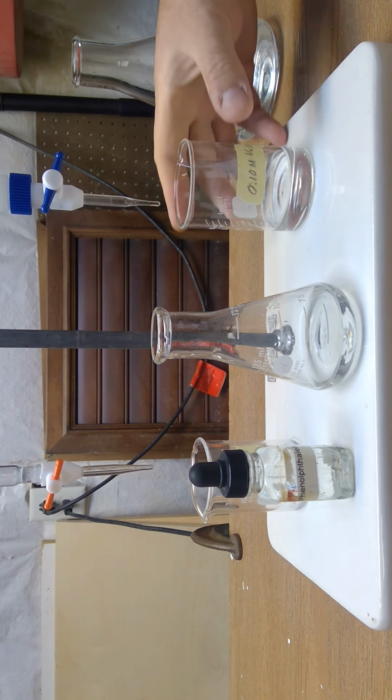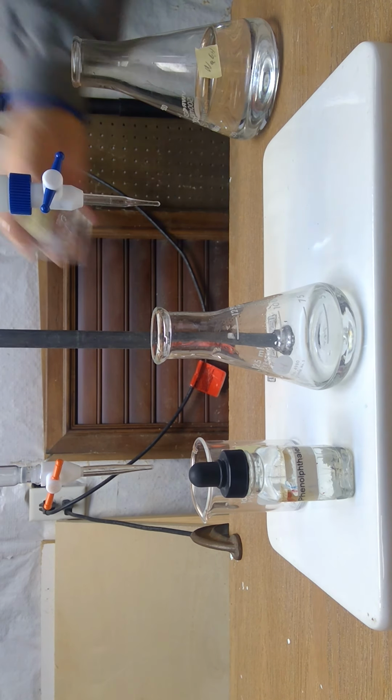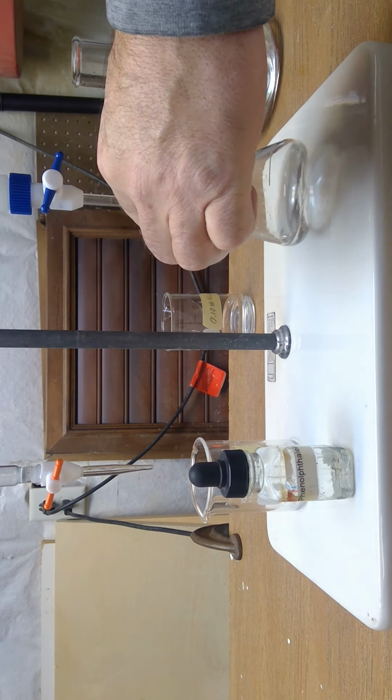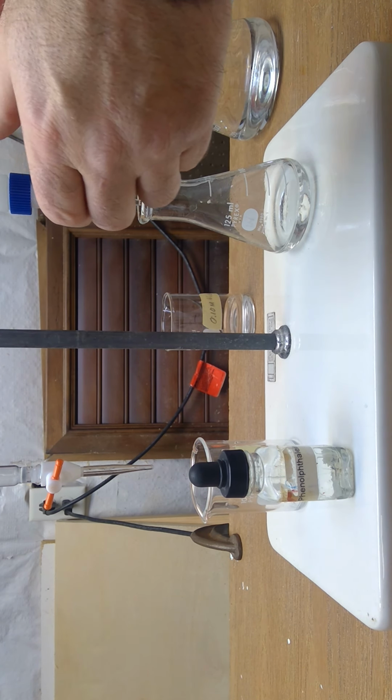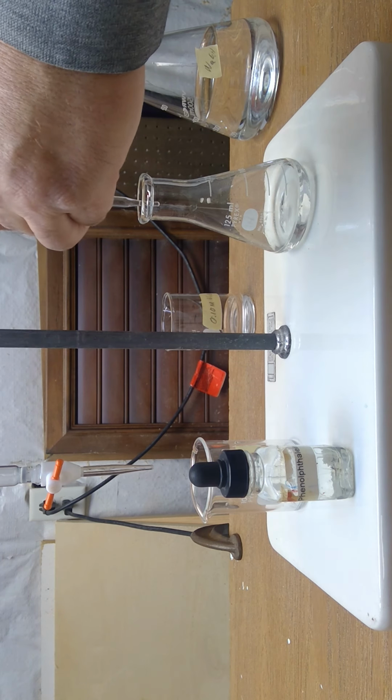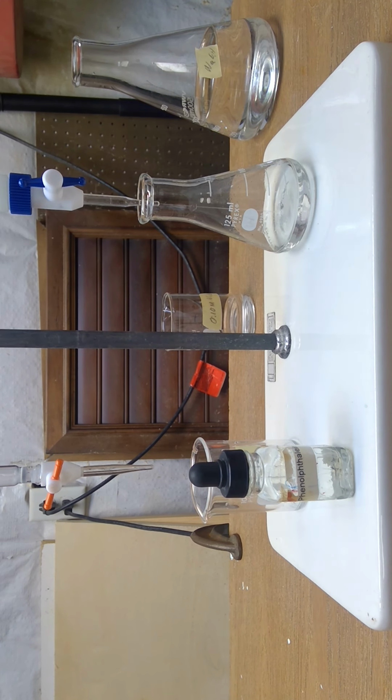All right, so we are ready to start our second titration. So now, we used 20.41 milliliters the first time. We better use about the same this time, okay? So I'm going to go really fast all the way. So if we double this, that would be 40, almost 41. So I'm going to go all the way to 40 pretty quick. So I'm going to let this just go.